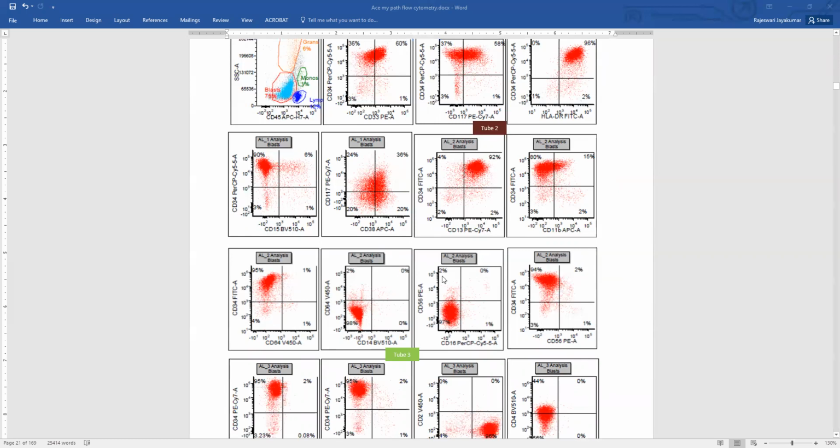They're negative for CD56. CD56 is considered an aberrant marker in myeloid lineage blasts, and it can be seen in leukemias arising from prior MDS, or in cases with t(8;21) when there is a KIT mutation. So there are some distinct entities that have an association with CD56 expression, and usually CD56 expression is associated with poor prognosis.